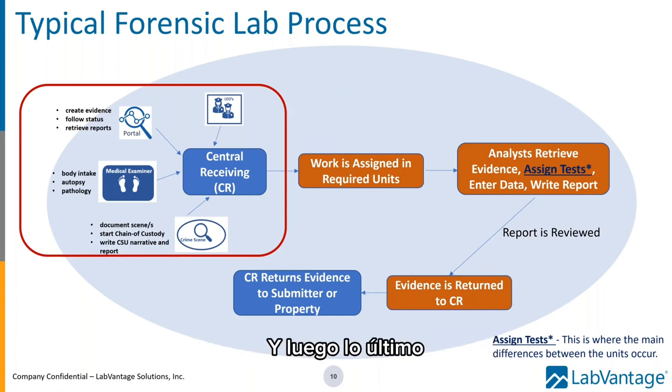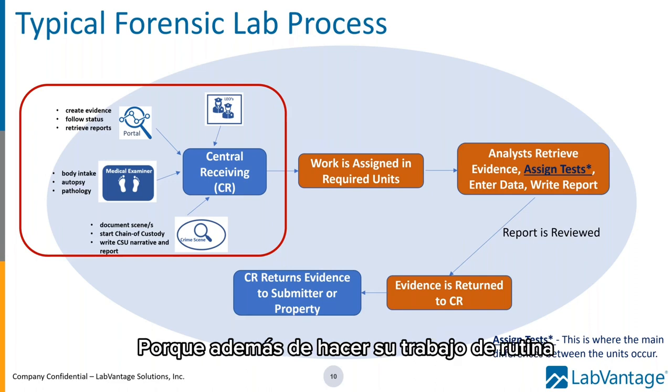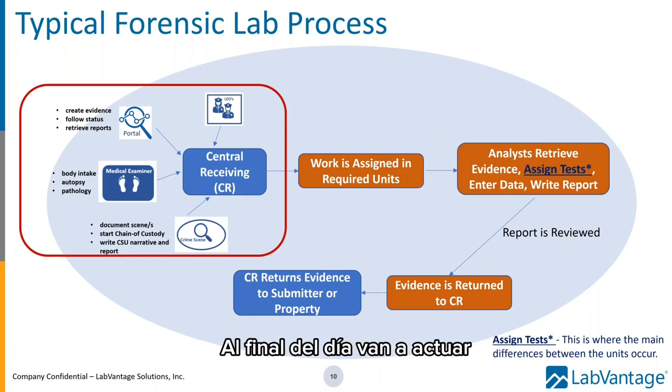And then the last thing I think that's a little bit different is latent prints needs to have a little bit of special consideration for data entry, because in addition to doing their routine work, at the end of the day, they're going to be performing comparisons between people and the impressions that they've developed.